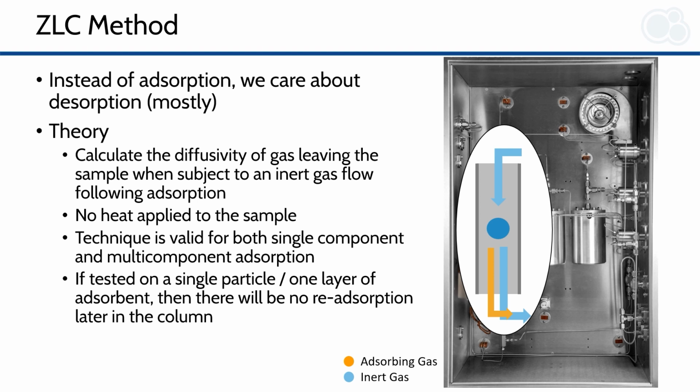Additionally, we're going to look to calculate the diffusivity of gas leaving the sample when subject to an inert gas flow following adsorption. So no heat will be applied to the sample, so the only driving force for desorption will be passing that inert through the sample and the slow diffusion of our adsorbing gas out to that purge gas stream. The technique is valid for both single component and multi-component adsorption.